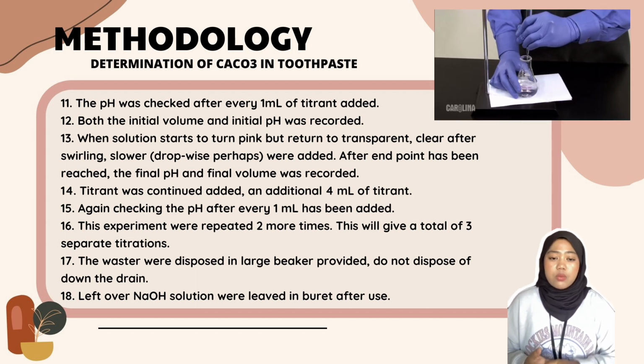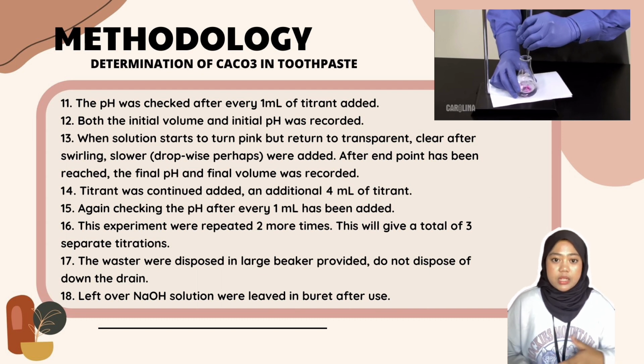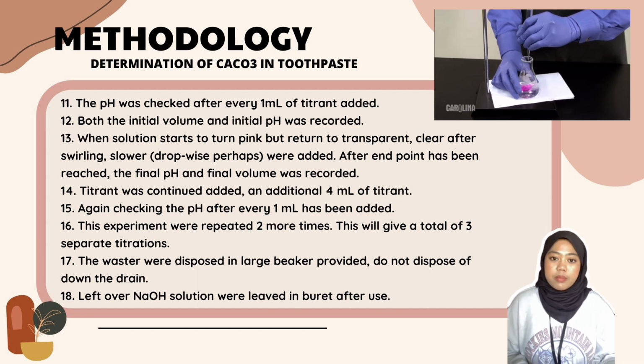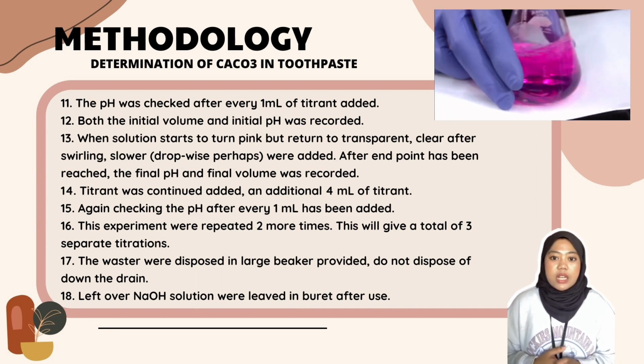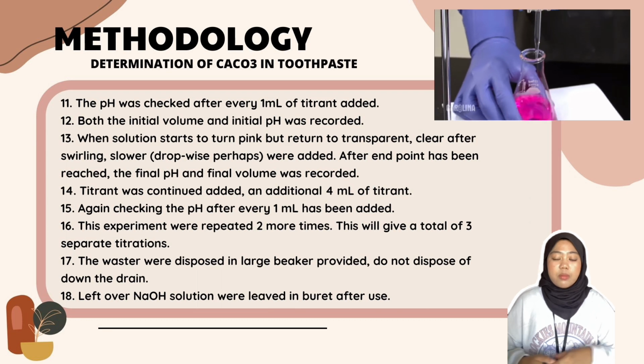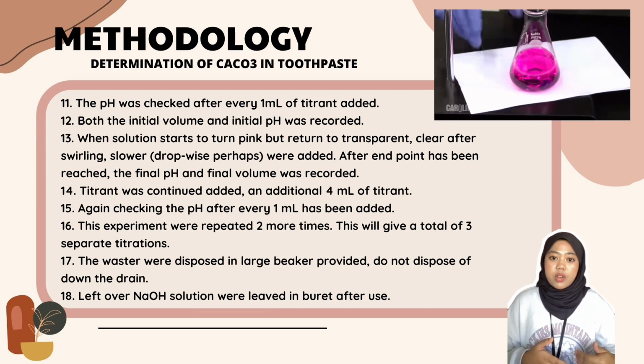After that, the waste was disposed of in the large beaker provided, and please remember not to dispose of it down the drain. And then lastly, the leftover sodium hydroxide solution will be left in the burette after use.